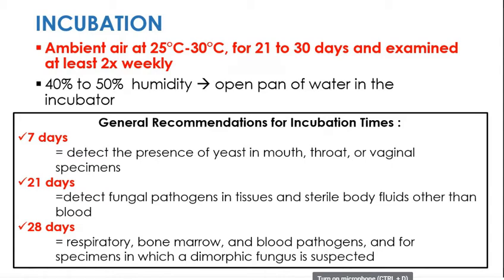Okay? Now, again, parang nasabi ko na ito dati, you keep an open pan para lang ma-provide yung humidity dun sa ating incubator. Okay, so maglalagay ka lang ng pan of water kasi kailangan na nila ng moisture and then also the humidity at 40 to 50%. So the general recommendations, you have it here and also in your module, the different recommended incubation times, you have 7 days, 21 days, and 28 days.